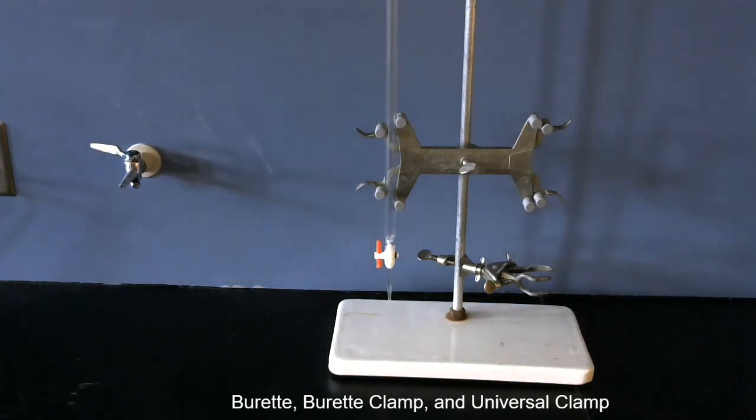What you probably can't see is that the burette is marked to the tenths place, so when you read a burette you want to estimate the hundredths place. That clamp lower on the ring stand is actually a universal clamp for clamping various things on your setup.